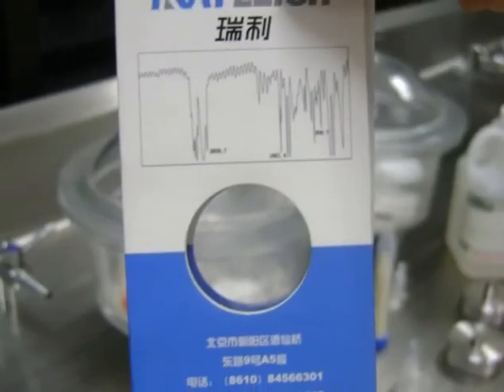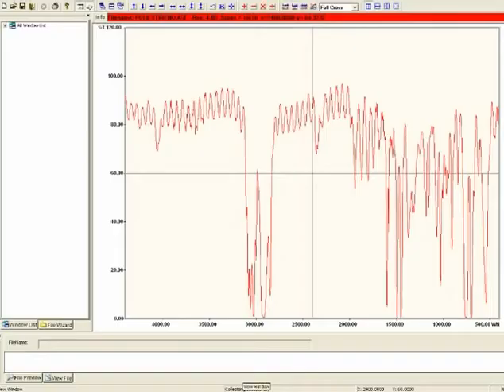Calibration. A sample of polystyrene was used to determine the good operation of the spectrometer. This sample includes a graphic with its corresponding IR spectrum. The comparison between this graphic and the graphics obtained by the real spectrograph made in the IR spectrometer provides a good indication of the spectrometer sensitivity.